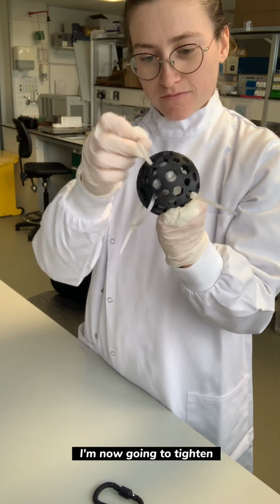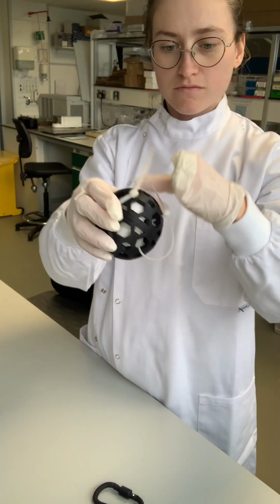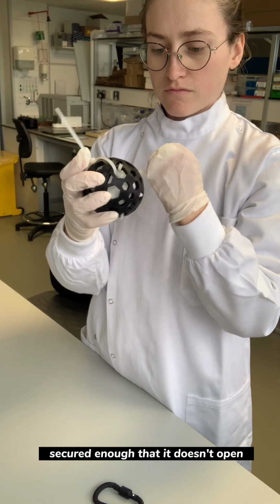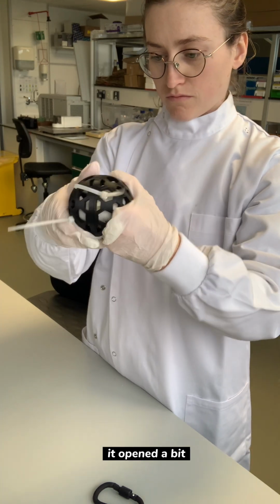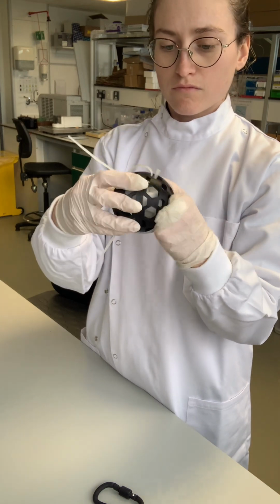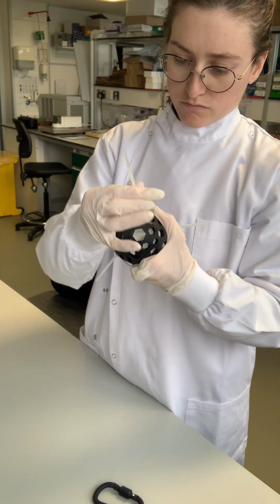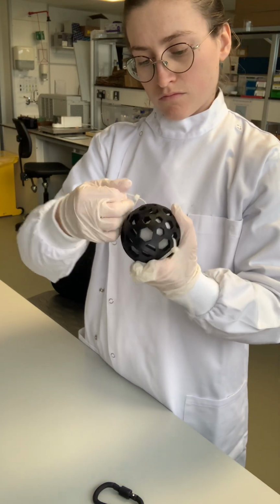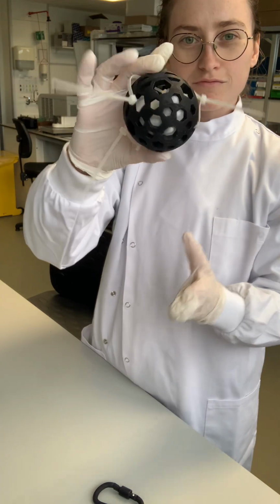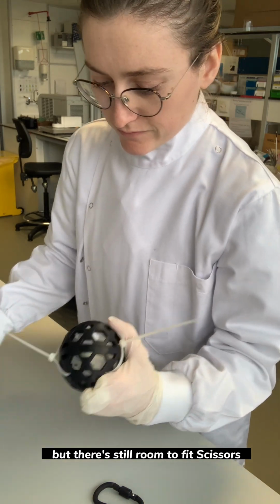At this point, I'm now going to tighten those outer zip ties on the Metaprobe so that the Metaprobe is secured enough that it doesn't open. So there you can see it was still too loose. It opened a bit, but not so tight that I couldn't fit a scissor underneath each one out in the field to cut it open. And there you can see it doesn't come apart, but there's still room to fit scissors underneath each one.